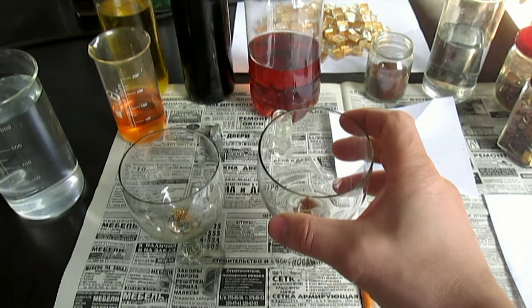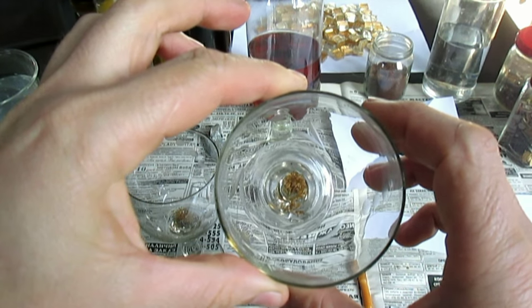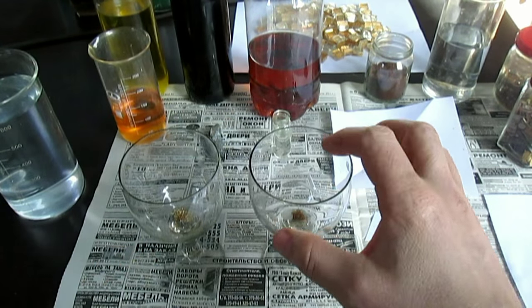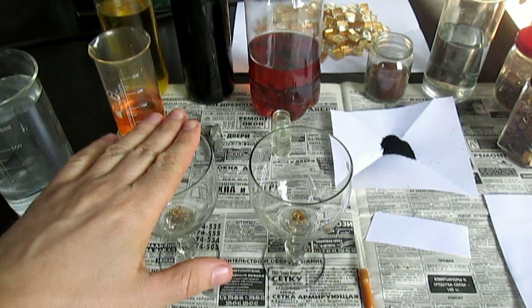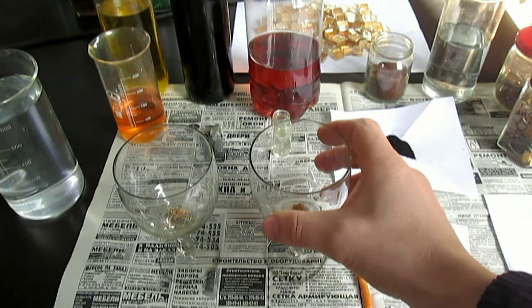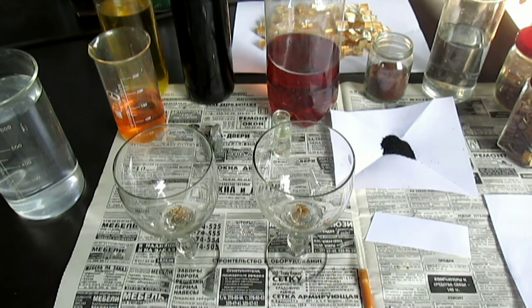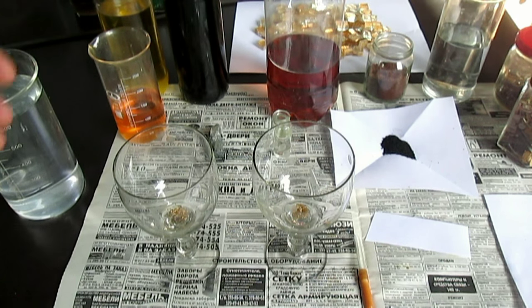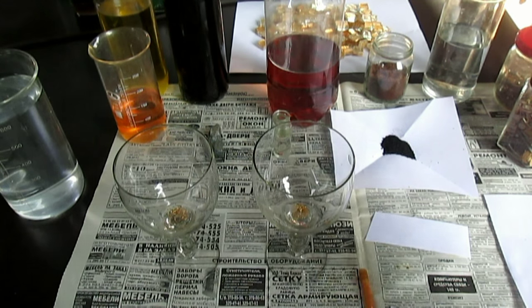Вот — я вчера позолоту протравил в азотной кислоте. Вот позолота — шелуха золотая, чистое золото. В одном стаканчике я сейчас буду растворять в стандартной царской водке позолоту, а в другом стаканчике растворю в суперреагенте. Я немного добавил сюда концентрата, чтобы было покрепче, чтобы быстрее растворилась позолота.